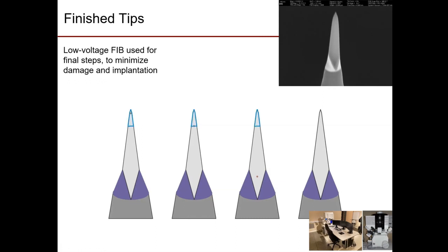The volume that is easily analyzable is going to depend on your sample material, but as a rough rule of thumb, the top 200 nanometers of any well-made needle should be within the range of what you can analyze, a micron or so in really well-behaved materials. And we need to position our feature of interest, as mentioned, in that volume. If it is near the lower edge of the volume, we may not be able to complete a measurement of it before other things happen. Obviously, if it's down near the welds, we're never going to measure it because we can't go that far down the needle and the welds don't run properly. And there is always the risk, if we overdo our milling, of milling our feature of interest out of existence. So a certain amount of care must be taken.